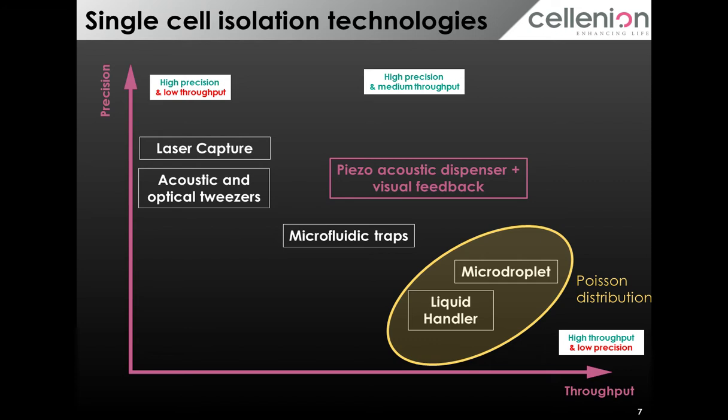And now Barbara McIntosh is going to present to you the technology on which all this CellenONE was based.